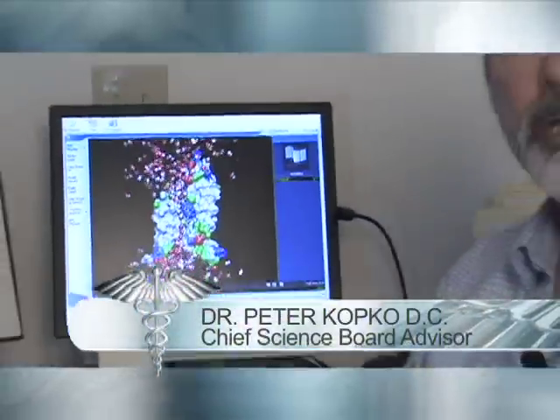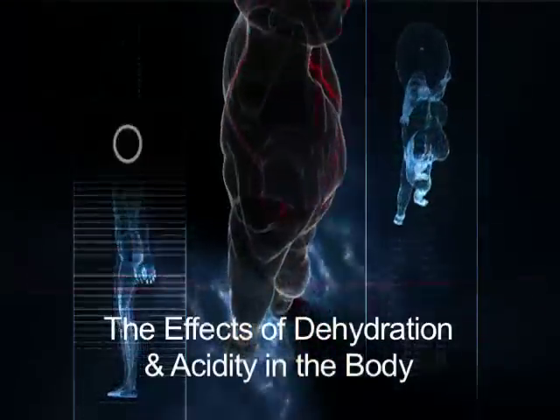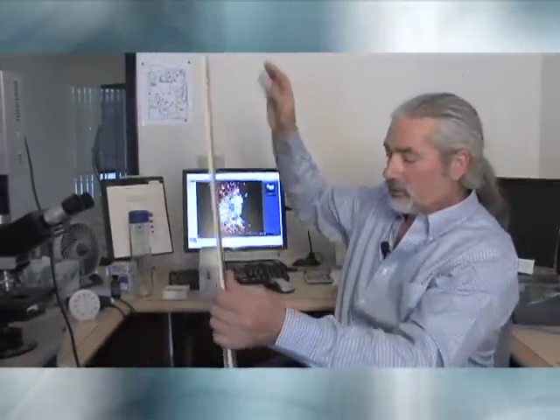Hello, my name is Dr. Peter Kopko. I am a chiropractor and practicing dark field microscopist. What I'd like to discuss with you today is the effects of dehydration and acidity in the body on some dark field parameters. I'd like to take a look at this chart.